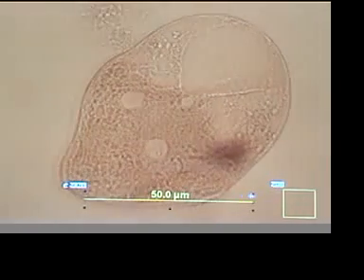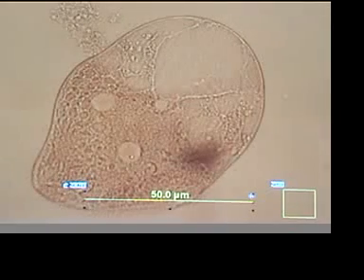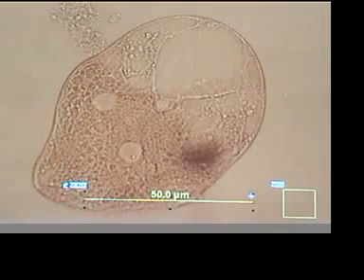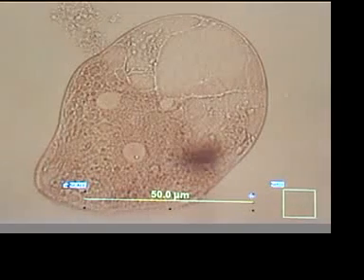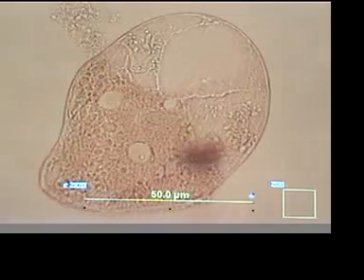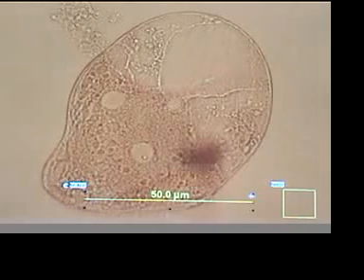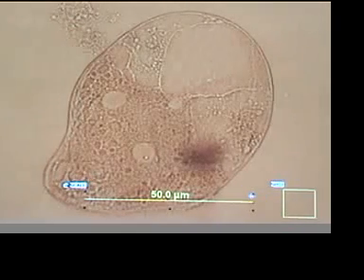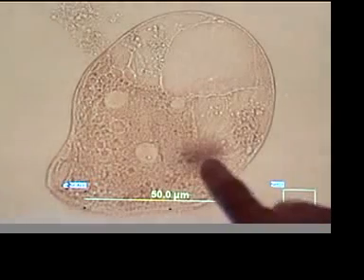This is me adjusting the microscope. And look how huge this internal vacuole has become. And other completely different exaggerated shapes. There's a kind of a strange shadow here, I don't know what that is.